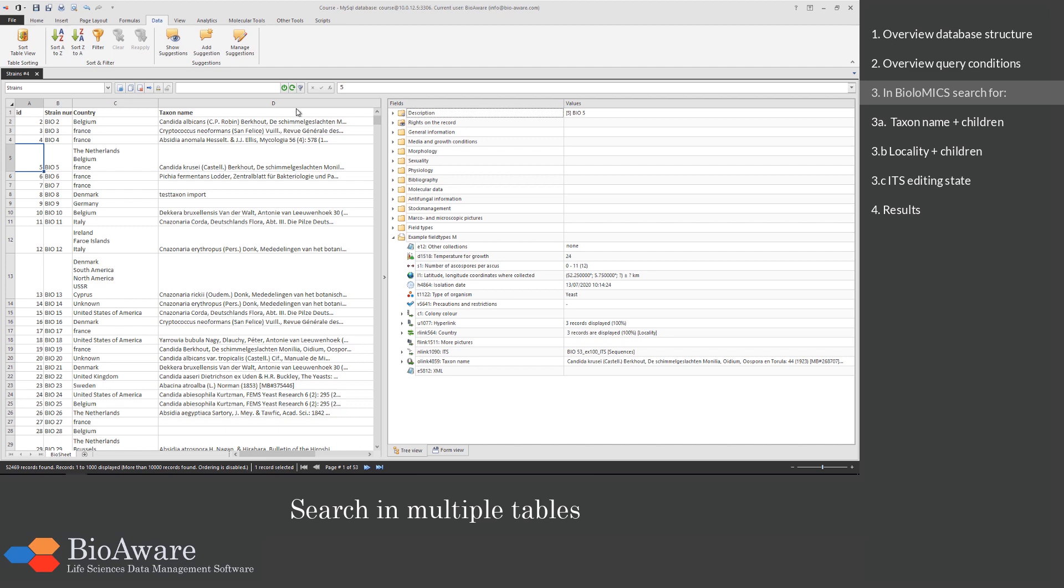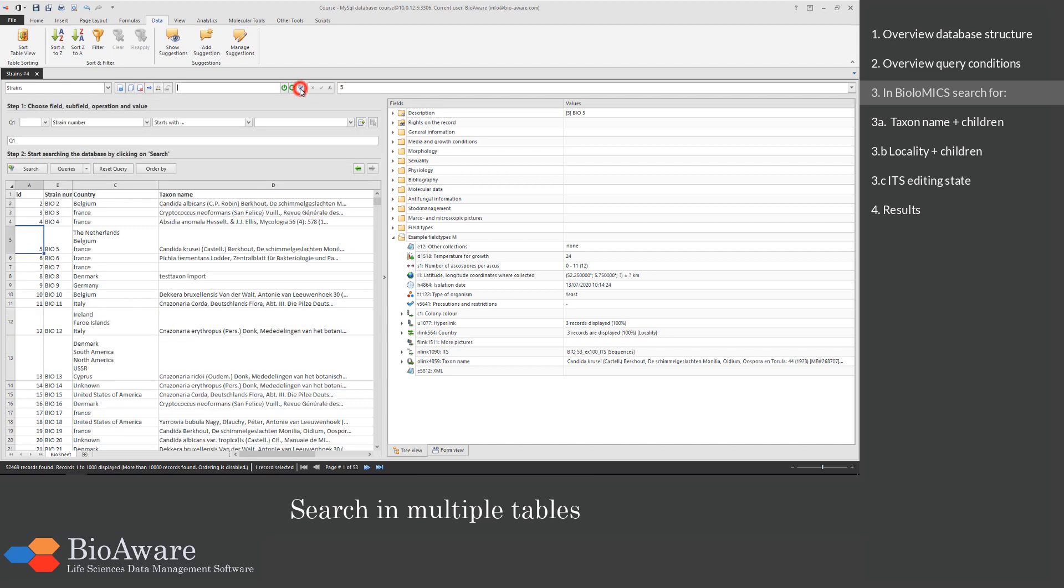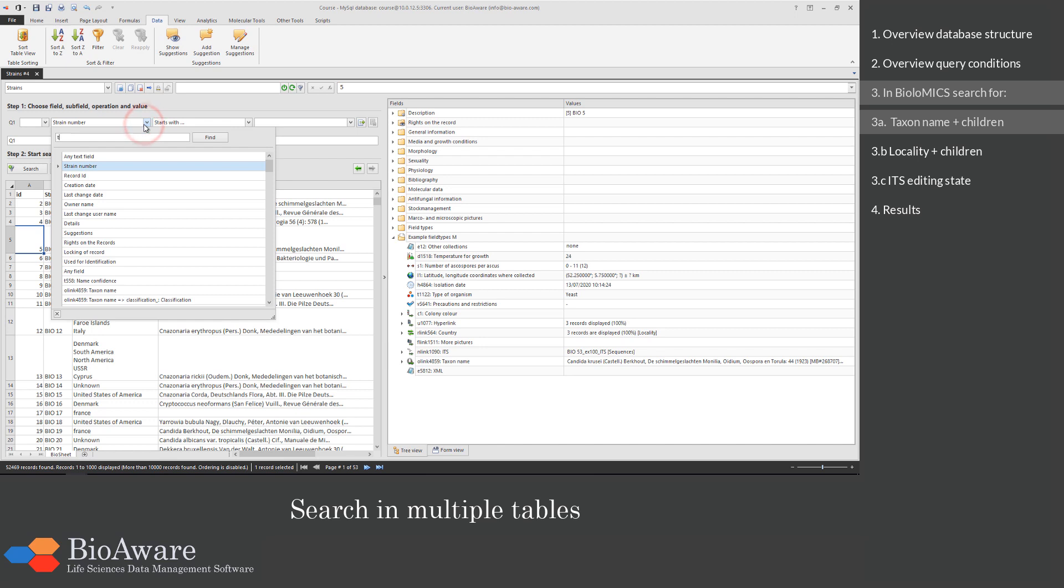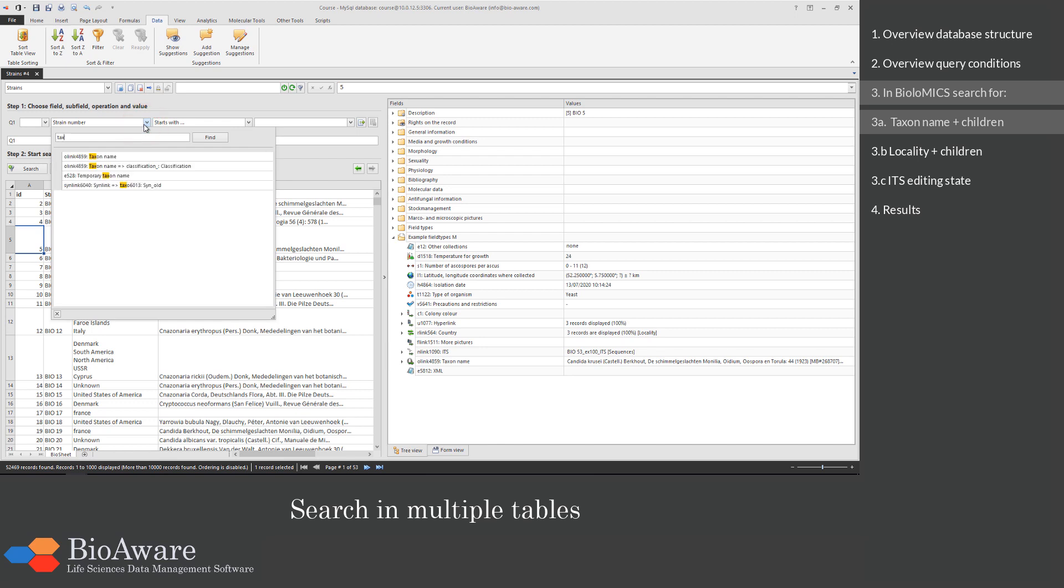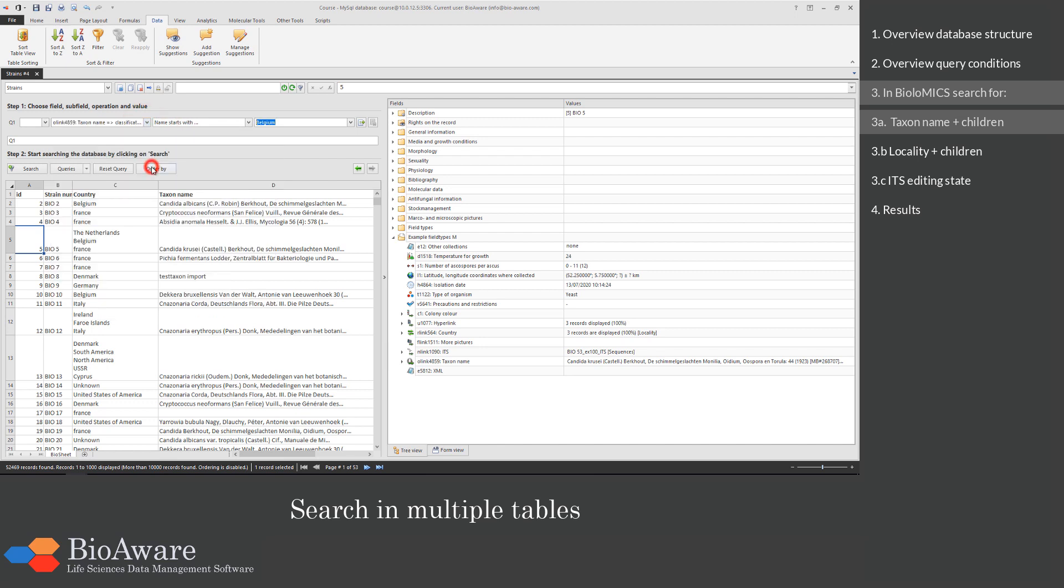We open the search panel and we start to search in the taxon name field. We will search where the name matches exactly candida, but also the children.